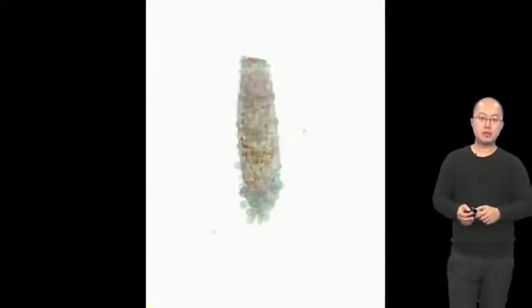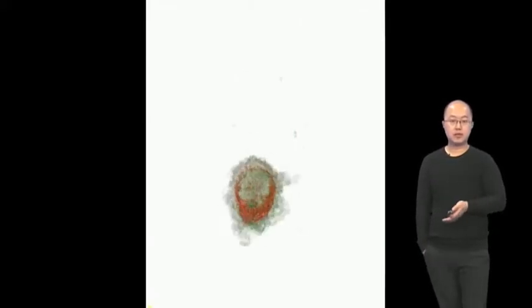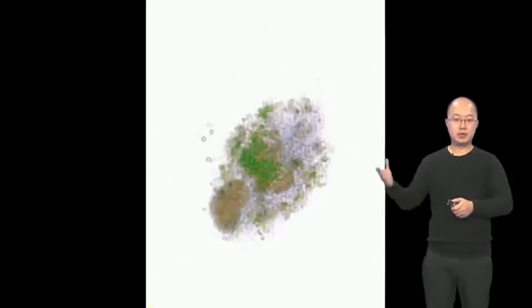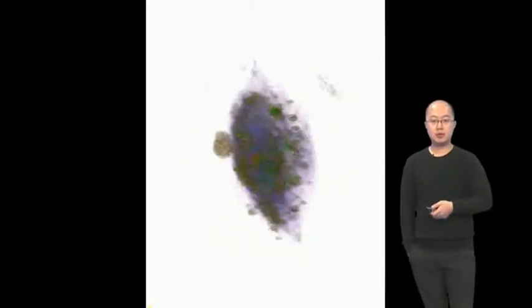And we also measured apoptosis, programmed cell death, and the hallmark of apoptosis is blebbing formation, and you can see the blebbing, and after some time the cells stop moving like this. So by measuring the cells, we also observe very interesting blebbing formation, which is very large compared to the previous one. And we can also visualize the other subcellular organelles, such as the nucleus and so on.